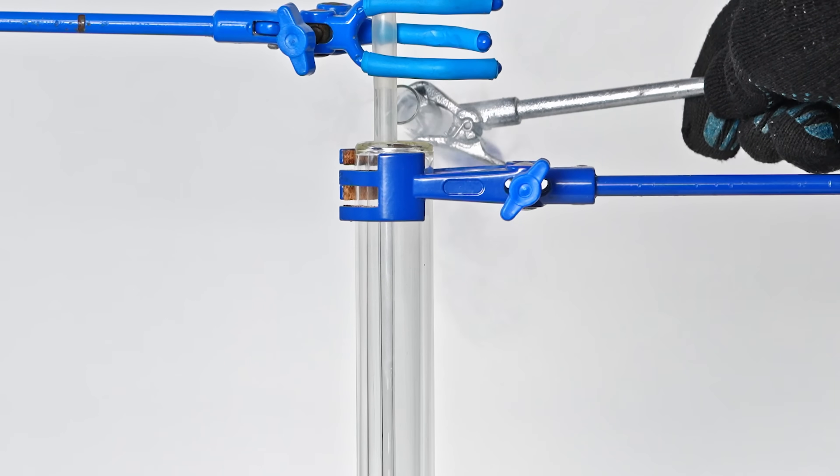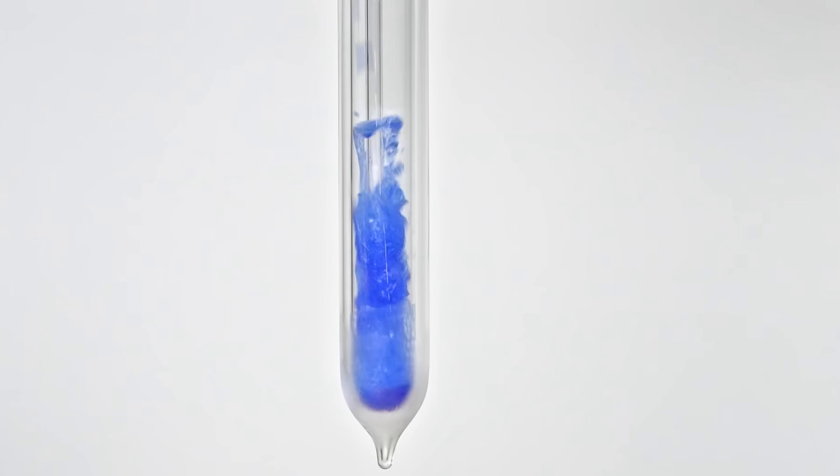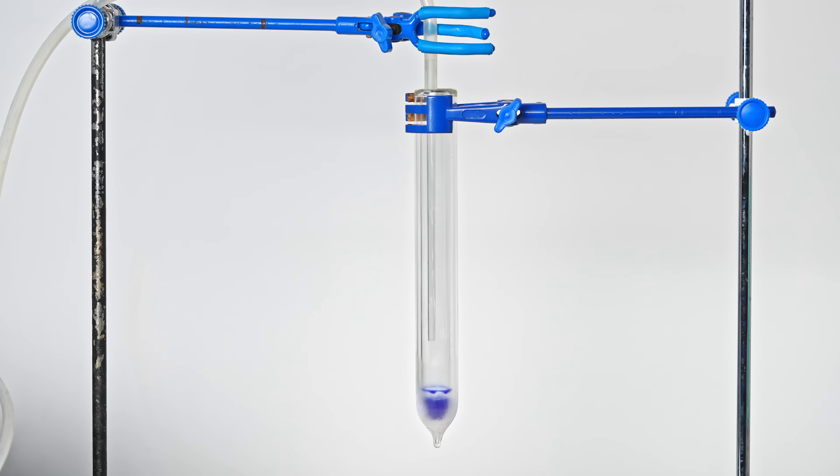Next, I used a DUER test tube, essentially a thermos tube that minimizes heat exchange with the environment. Adding ozonated oxygen to this test tube allows the oxygen to evaporate quickly, leaving behind extremely dangerous liquid ozone.